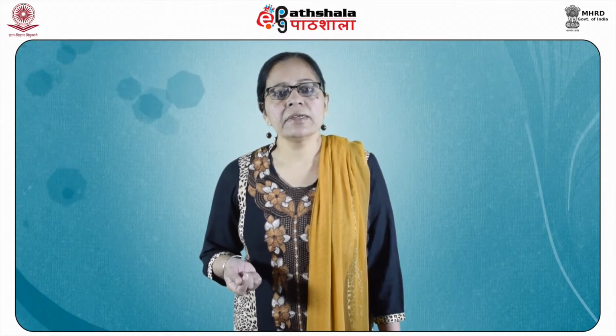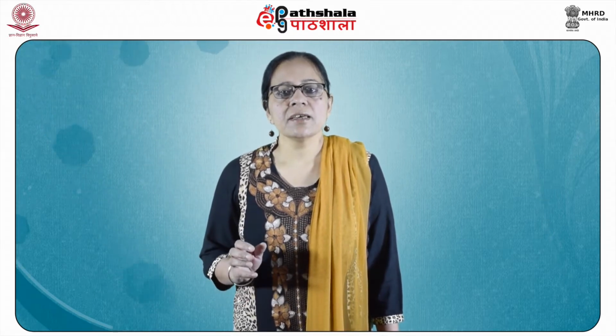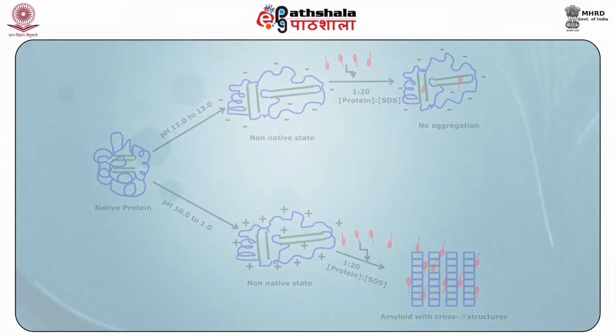According to the original technique developed by Laemmli, SDS was introduced in the gel, but now incorporation of SDS in the gel is not required. SDS in the sample buffer is sufficient to saturate proteins, and the SDS in the cathode buffer maintains the SDS saturation during electrophoresis.